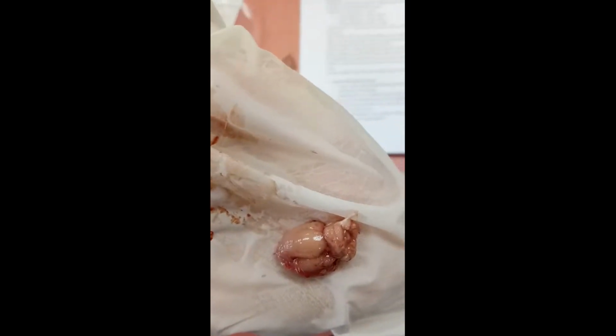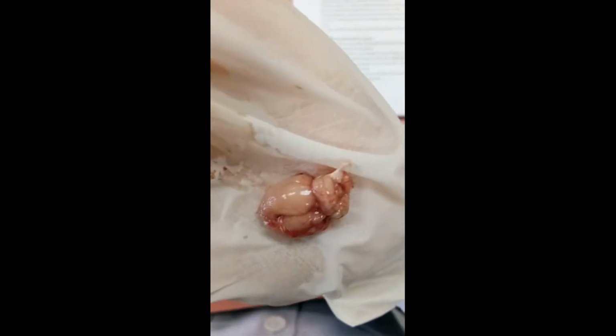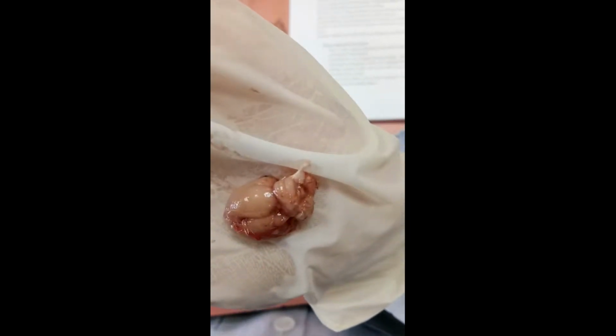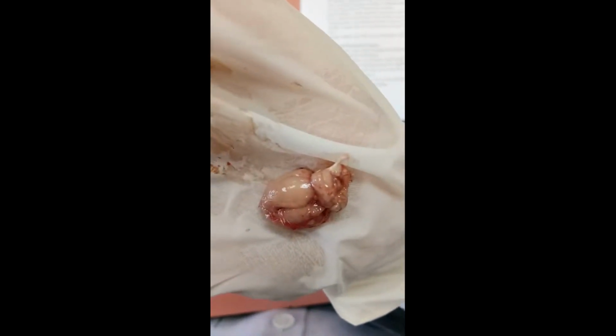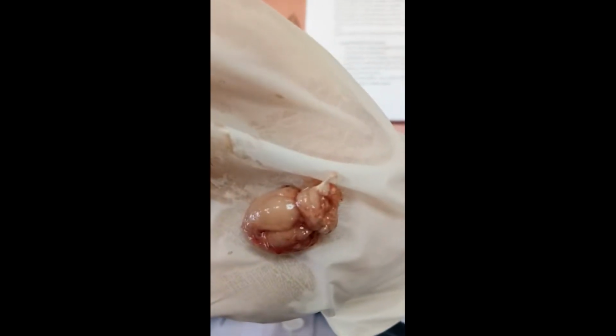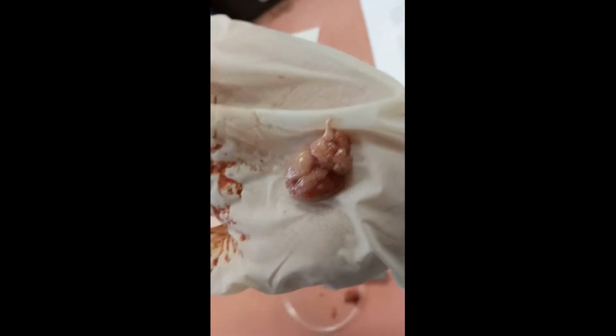For the prosencephalon, there are three parts: A, the olfactory bulbs, B, the cerebral hemispheres, and C, the hypothalamus. For the mesencephalon, the cerebral peduncle is formed by a huge bundle of fibers through the floor of the mesencephalon, which is the tegmentum.